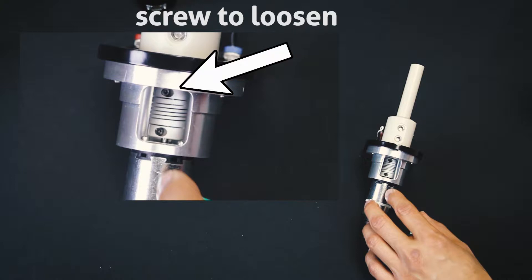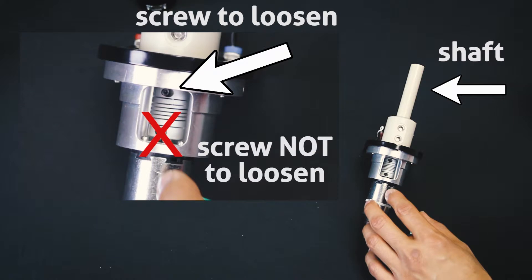Loosen the hex screw that is closer to the shaft using the 1-16th of an inch hex driver. Do not touch the hex screw that is closer to the motor wire assembly.